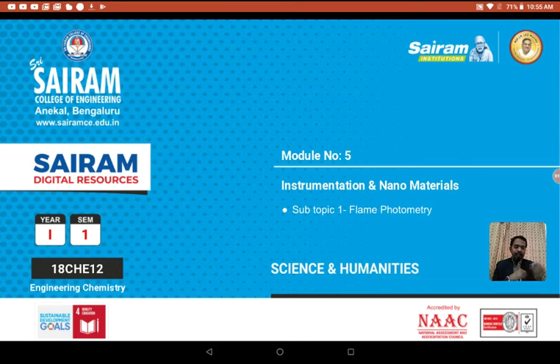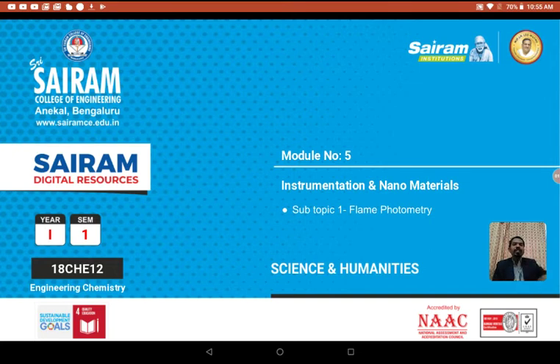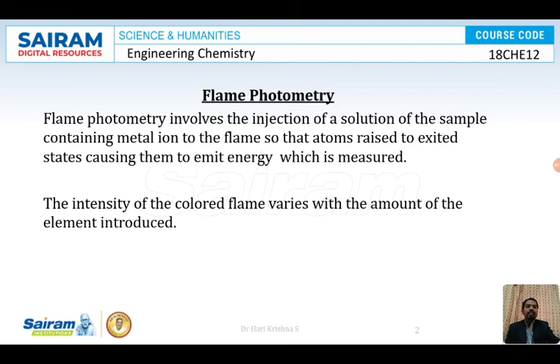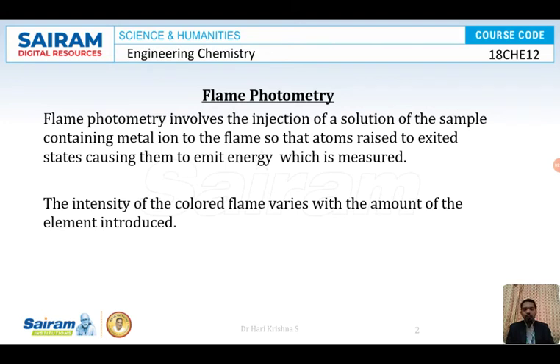That is the basic principle of flame photometry. The basic principle is that when a solution containing a metallic compound is exposed to a flame, vapor containing metal atoms will be formed. Some of these metal atoms, which are in the gaseous state, may be raised to a high energy level, sufficiently high to permit the emission of radiation. This method is generally used for analysis of sodium, potassium, calcium, lithium, etc.